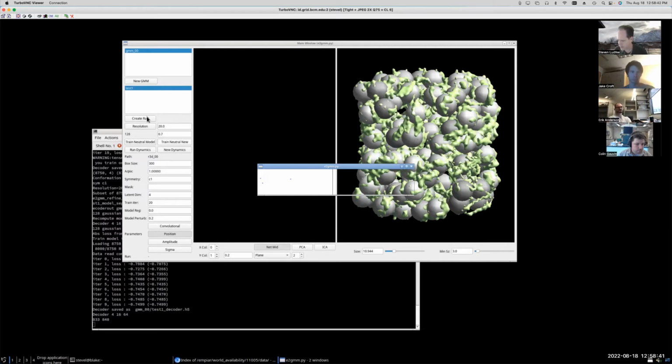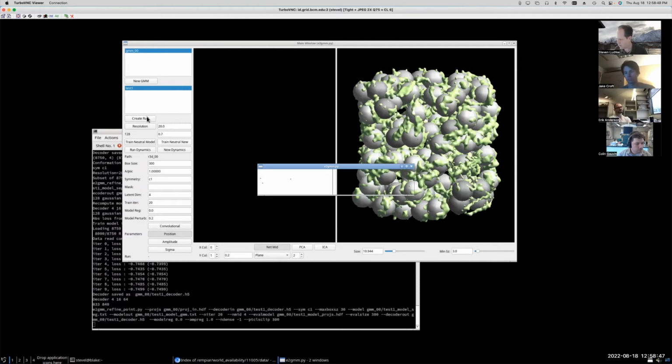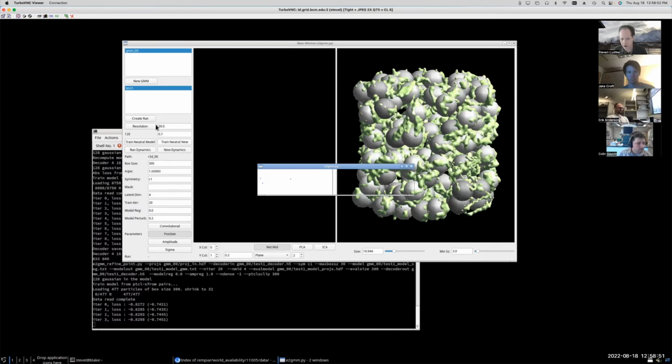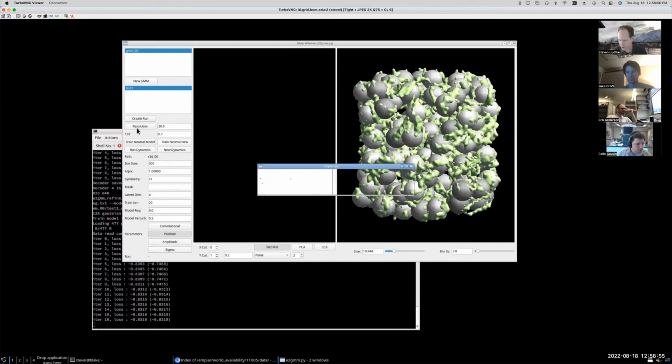It's not actually anything you have to worry about. It's basically complaining that you have a run and you're trying to display the run, but there are no results for it yet. And of course, there aren't any results yet because you haven't actually run the run yet. So you shouldn't get errors when you do the next resolution step.